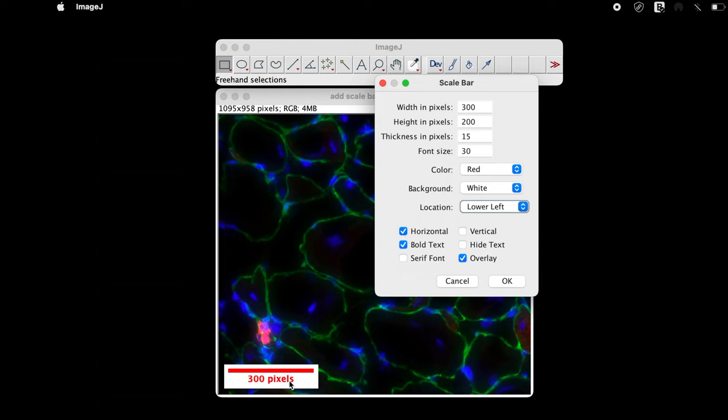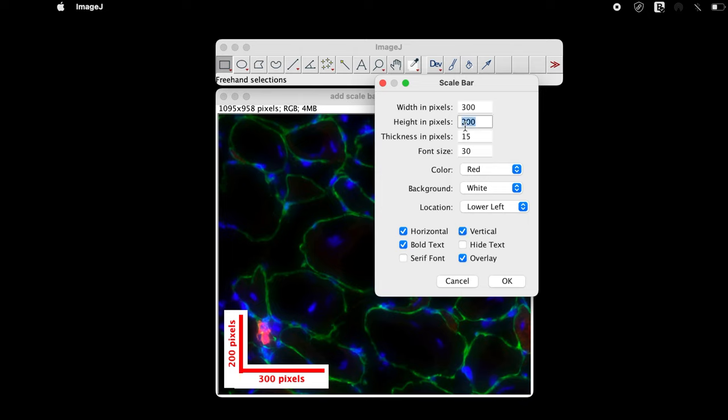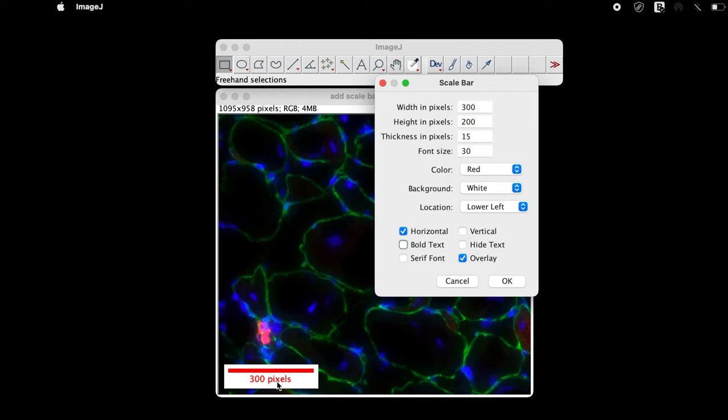The scale bar can also be set vertically. Check on vertical and the scale bar would be set vertically. One can also change the scale bar by changing the parameters at height in pixels.